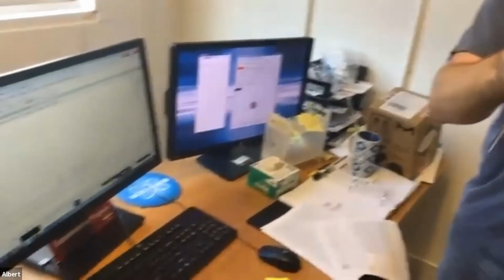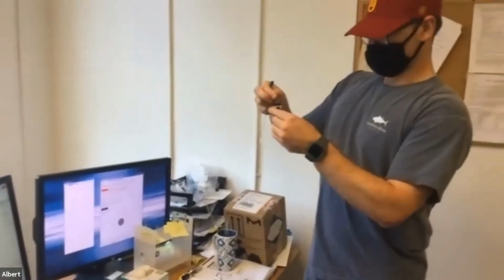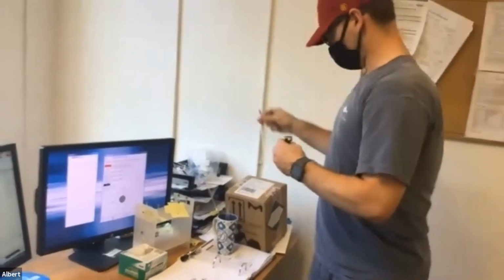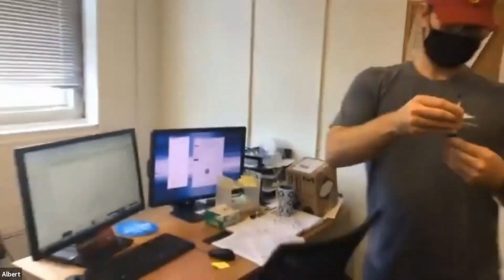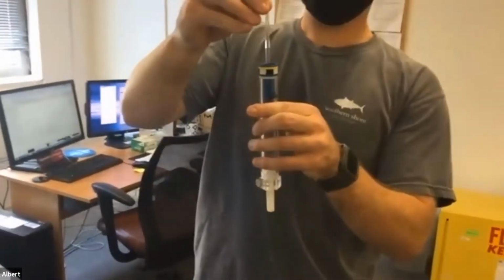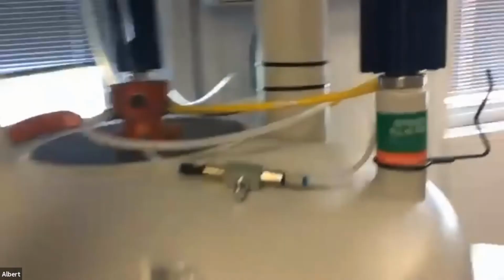Cap it off. And then take that label off, and then you can just put it into here. Yeah, you can just stick that back in the cup. Yep. Take that out. Sit it back down in the cup, and then put that through the spinner. And let me get the depth gauge. Sit it in there, and then make sure it's at the right depth. Boom. That's fine. So now I'm going to put this into here and just go over and type.